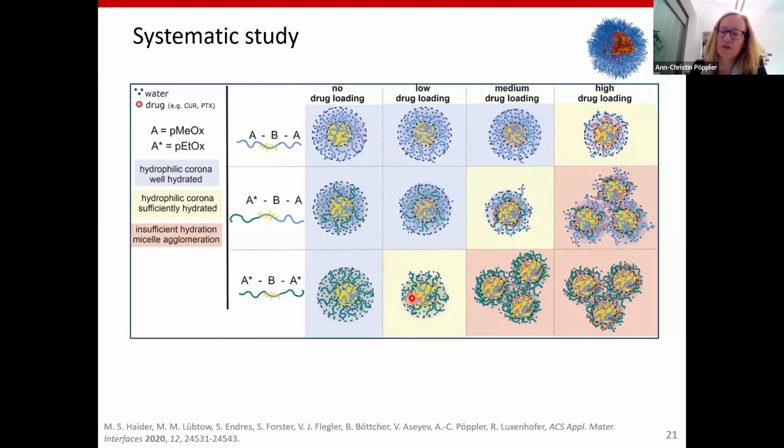Then we have an intermediate region where this is starting to suffer. And then we have the moment where we have these jelly agglomerates that are forming, so that particles are sticking together when we see a large drop in the signal intensity.